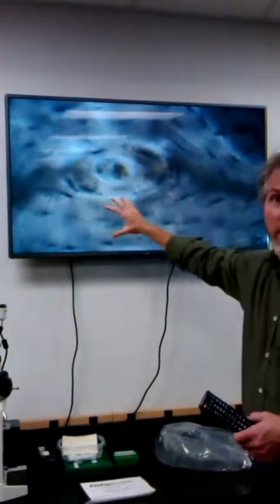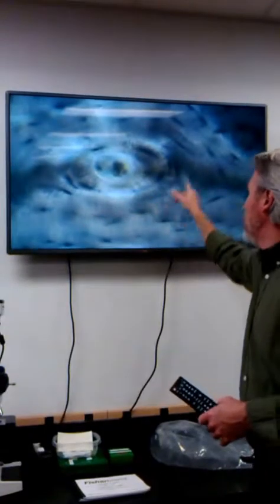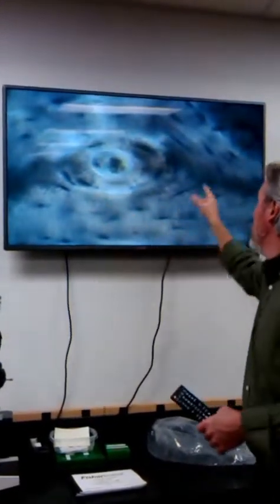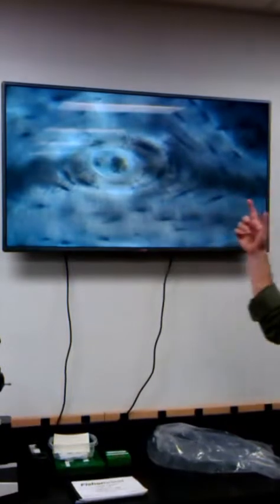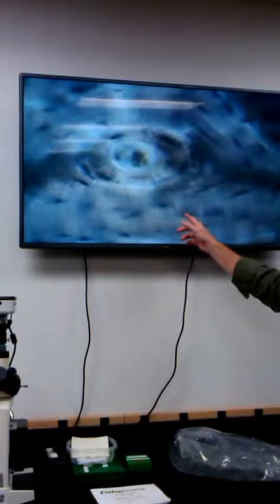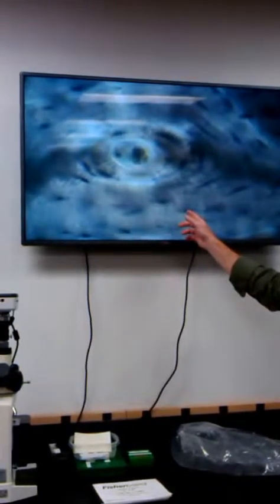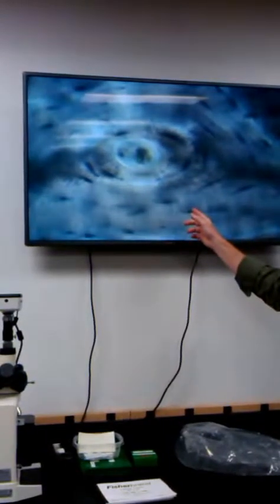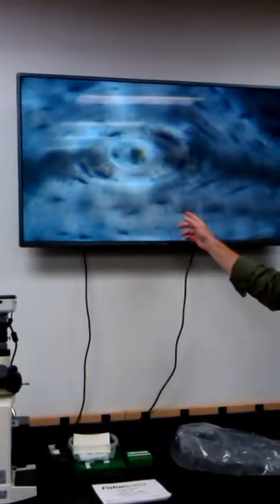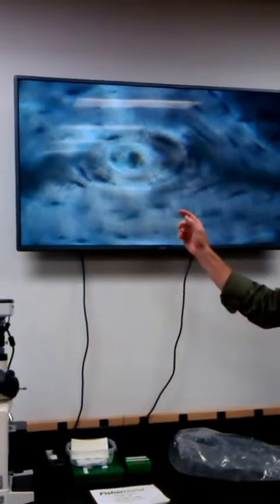All as one unit, right? And so the individual layers that you can kind of see how they make their own tree rings, so to speak. Those would be the lamella. And then we actually see these dark patches here. This is where the lacuna would hold the osteocyte. Okay. So the dark lacuna part. Lacuna holds the osteocyte, and then all the little lines, canaliculi. A little faint.